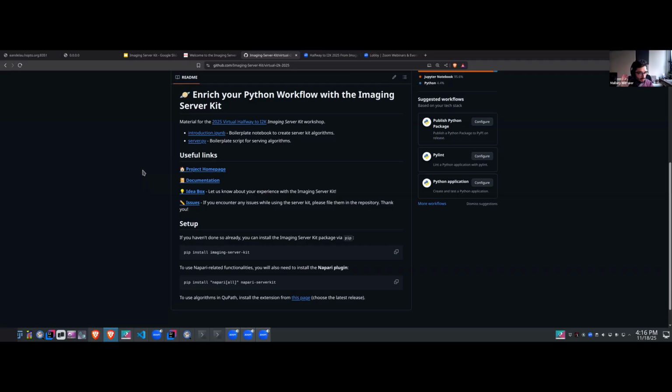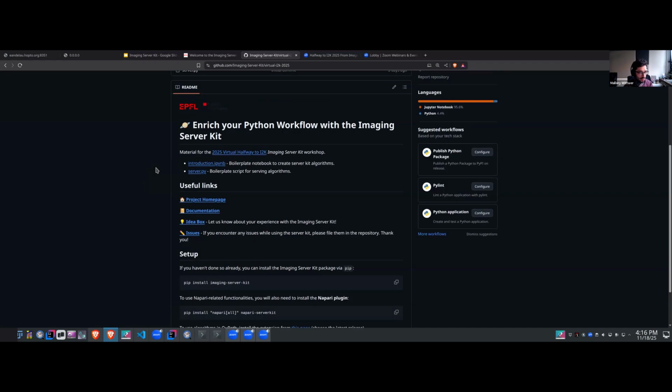If you're very comfortable with Python and you want to follow along, you're welcome to try that. For me, it's not a requirement at all. It's also perfectly okay to just watch me go through the demonstration. This is also recorded, I believe, so you should be able to also view the recording later on.